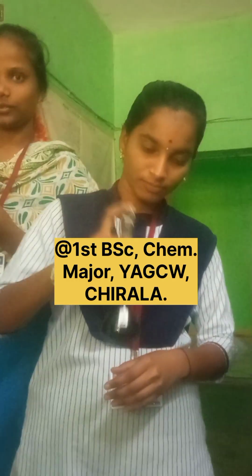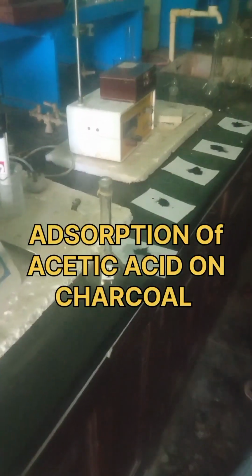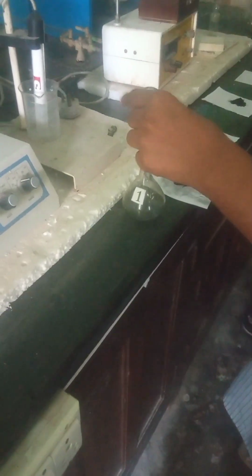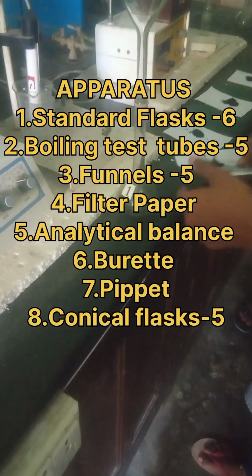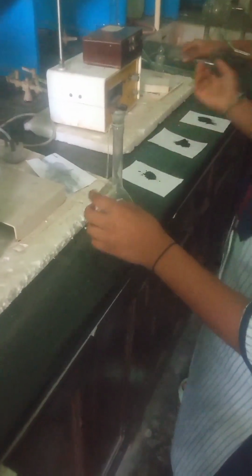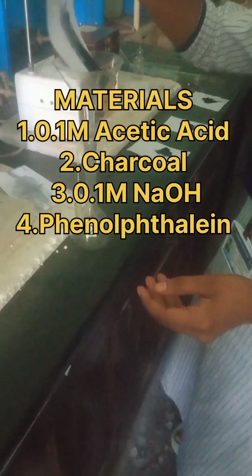Adsorption of acetic acid on charcoal. This experiment helps us to validate the Freundlich adsorption isotherm, which reveals the relation between intensity of adsorption and mass of adsorbent. Here, acetic acid is the adsorbate and charcoal is the adsorbent.